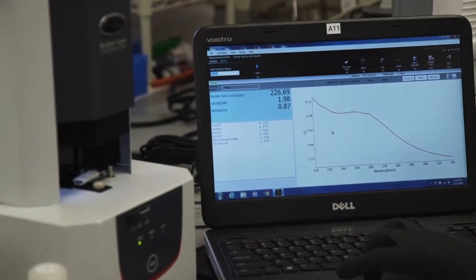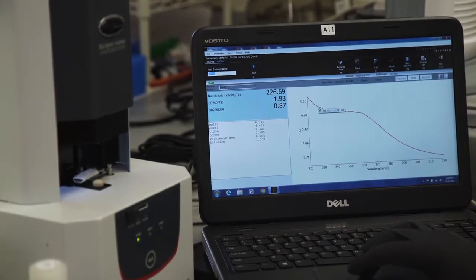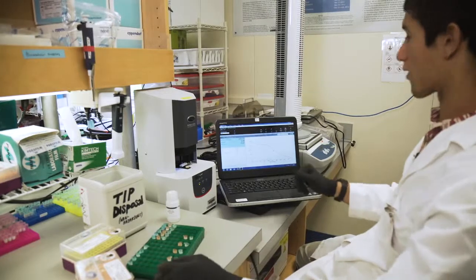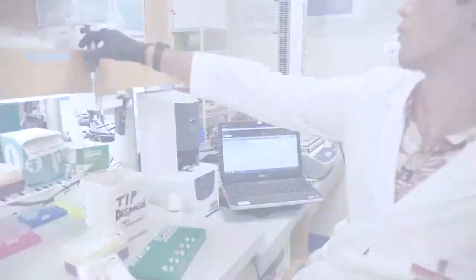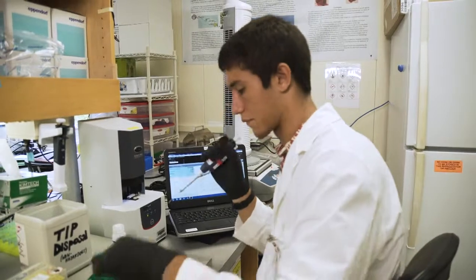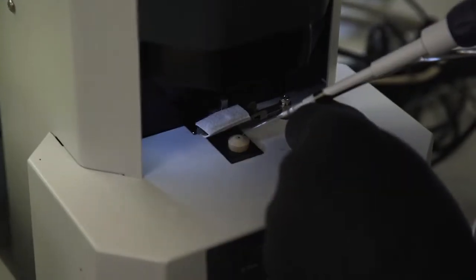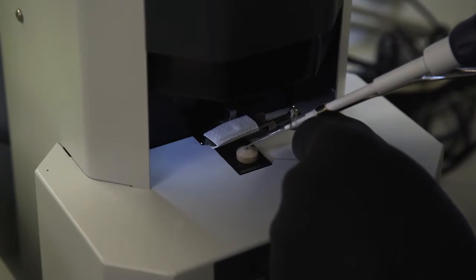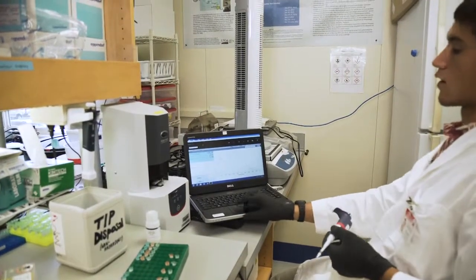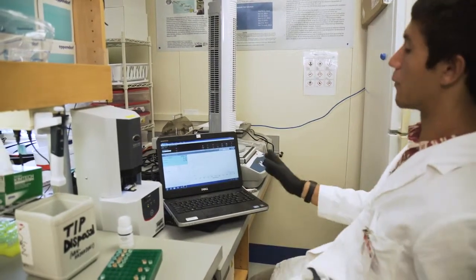Normally with this curve, if I washed the DNA a little bit better or a little bit longer, you'll see a deeper valley here, and then it'll come back up for a peak. That sample is fine for running PCRs, so we'll go ahead and check our next sample. Punch in the sample name, grab your sample. Now this one should be interesting. Yeah. So although the number's lower, there's less DNA in it, this valley's deeper, so this is a cleaner piece of DNA.